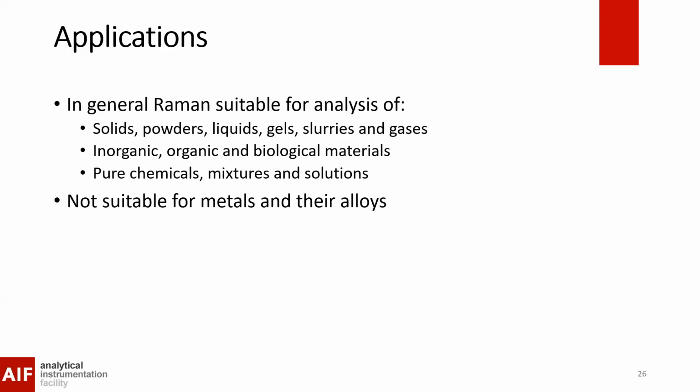However, Raman is not very suitable for metals and their alloys because of the low polarizability change. Almost zero induced dipole moment can be observed for metals.